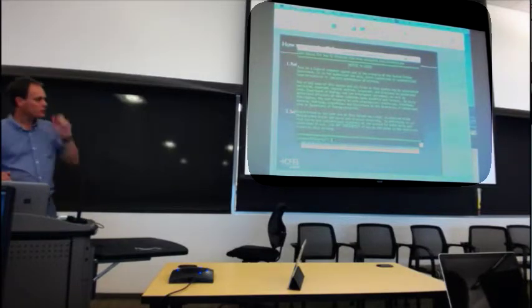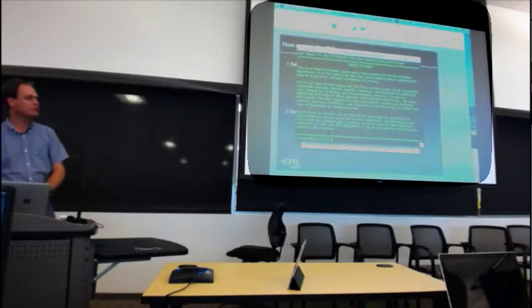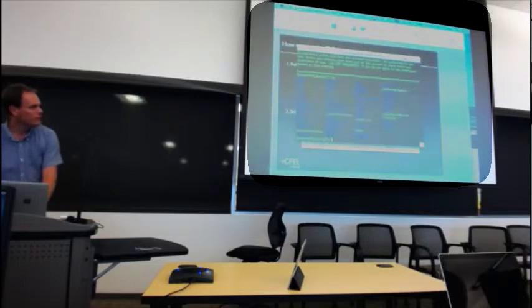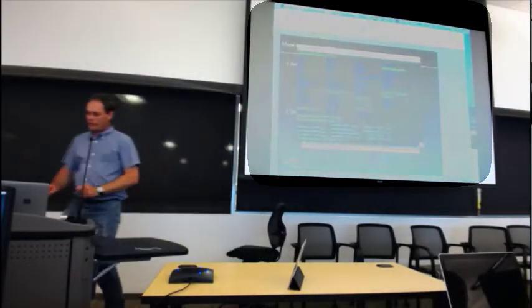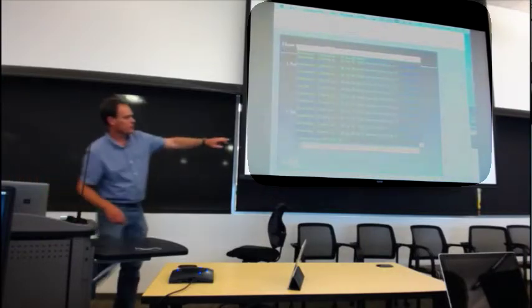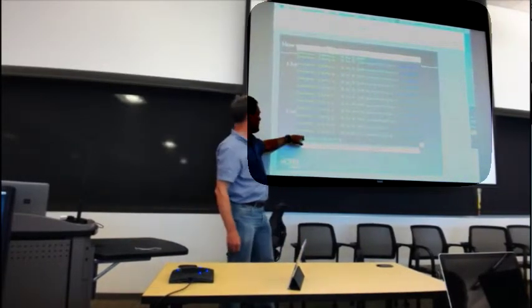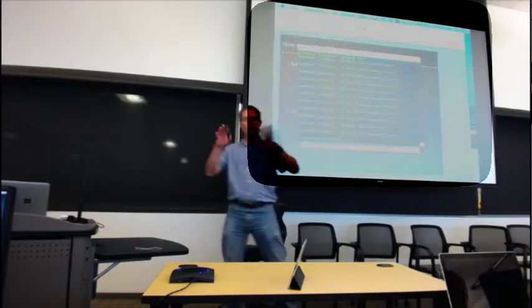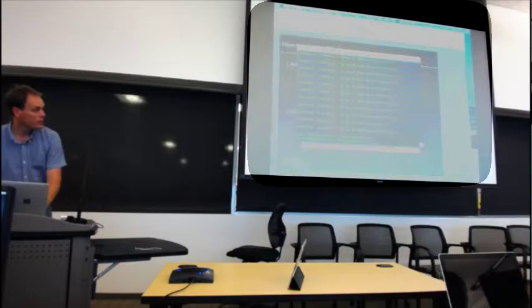Okay, so let me show you what I do here. I just changed tack a little bit and brought up an interactive window because it might actually help explain things here. In my setup, I've been in a few experiments, so sorry about the colors. I can go into a 2014 directory, and in there I have links to all of the experiments. They're just symbolic links, so I can go into this. This is the tutorial one here, and I just create a bunch of links like this to make going around the world easier.